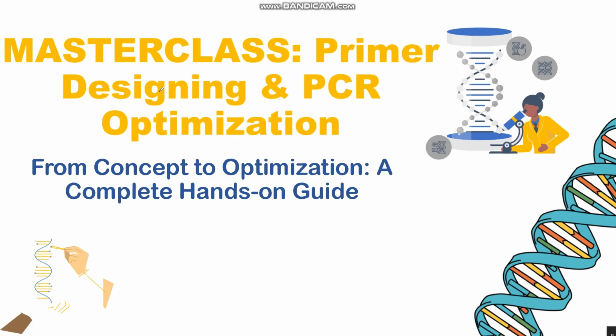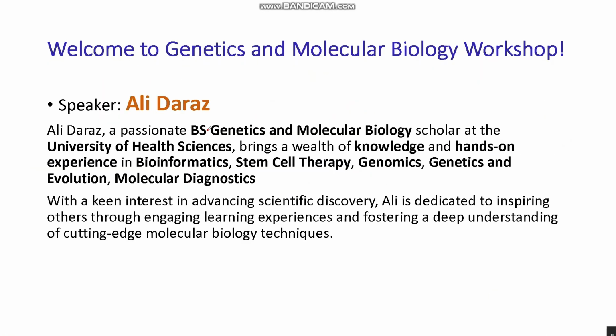So today's masterclass is about primer designing and PCR optimization. It is about how to design primers and how we can optimize PCR to get better results. It is from concept to optimization, a complete hands-on guide. So first of all, I am going to tell you about me.